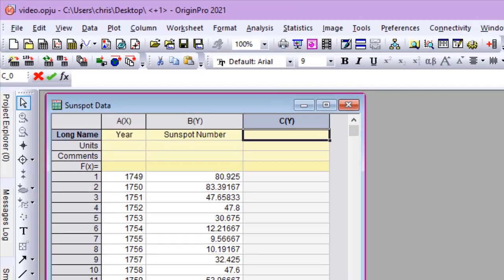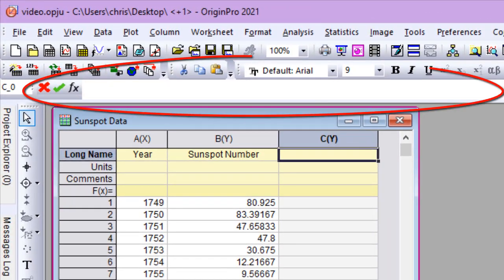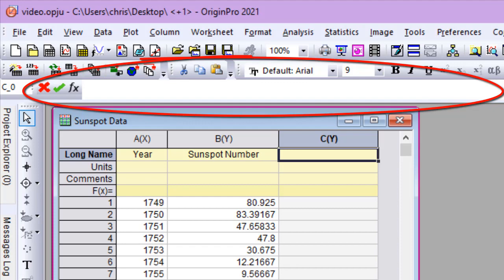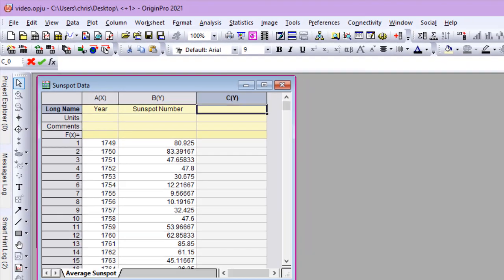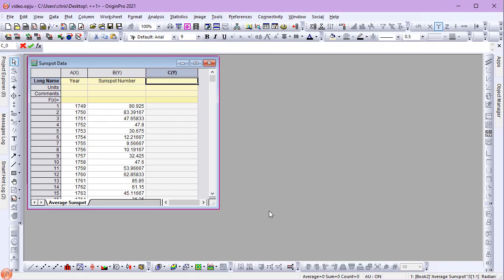The new origin formula bar is a central location for entering column and cell formulas, modifying label rows, and more easily viewing long passages of text in cells.